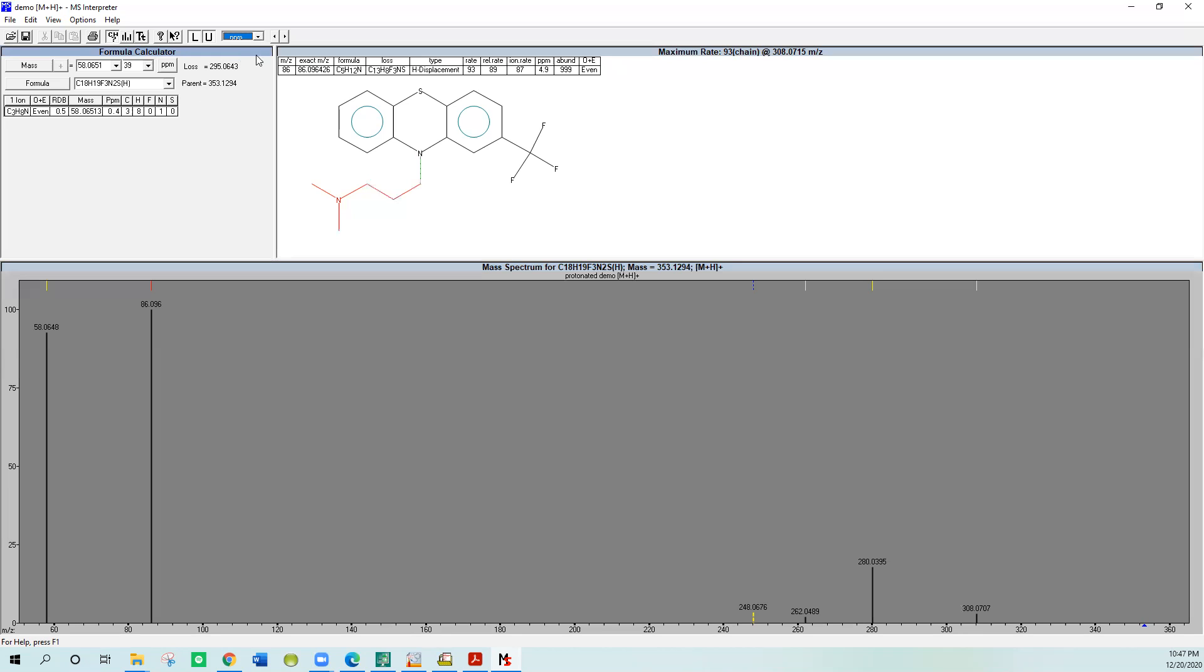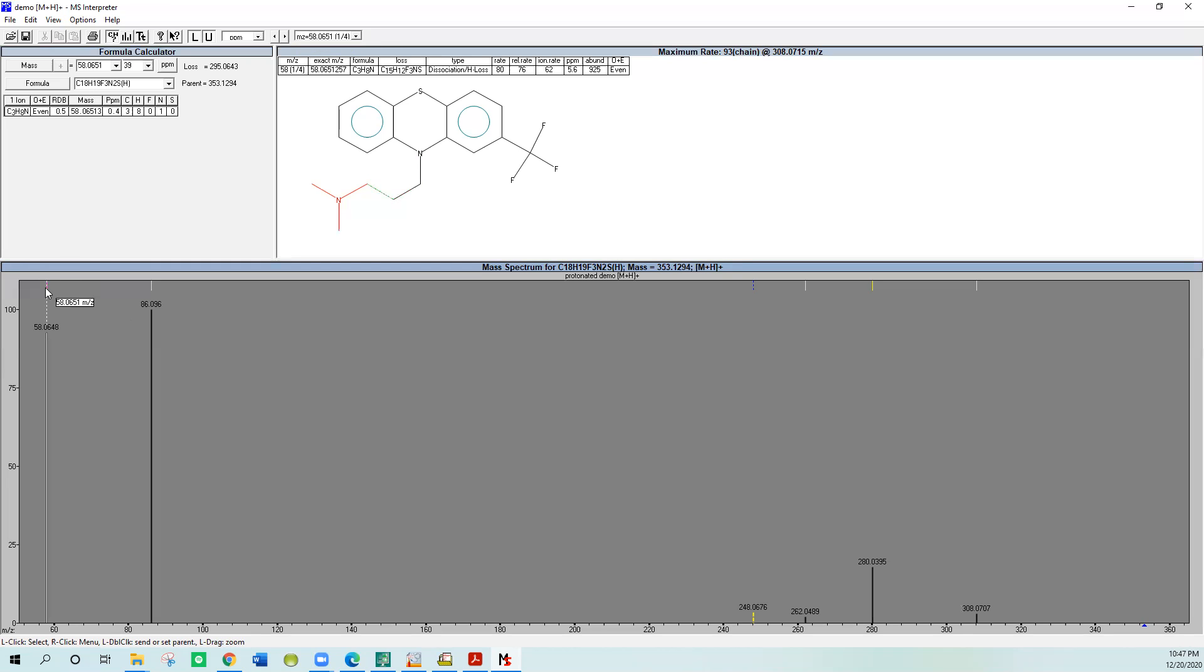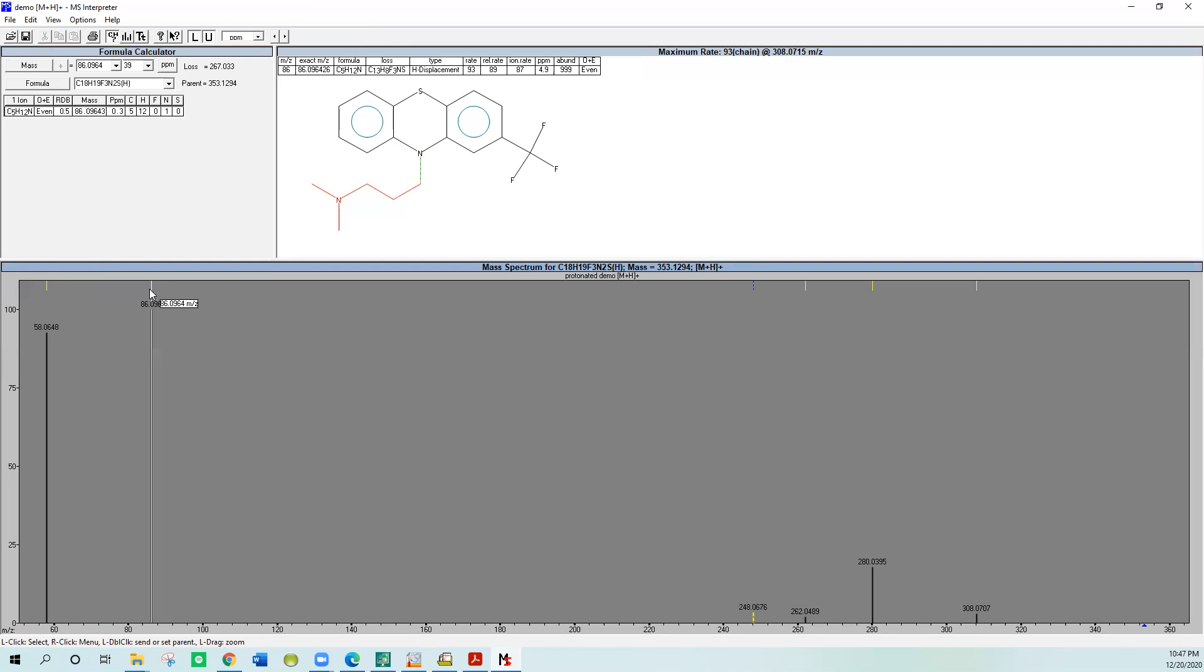We'll click on the 58 again to get it highlighted. You'll notice this is one of four. So it knows four different things of what it might be. If you get on the hash mark, the little tick mark, and click it left mouse button again, you'll see it goes to two of four, three of four, and four of four. It shows you all the different possibilities. You can go to the next ion and do the same thing. Here there's only one possible structure, and it's a good fit. 0.3 parts per million makes sense for this nitrogen type fragment.